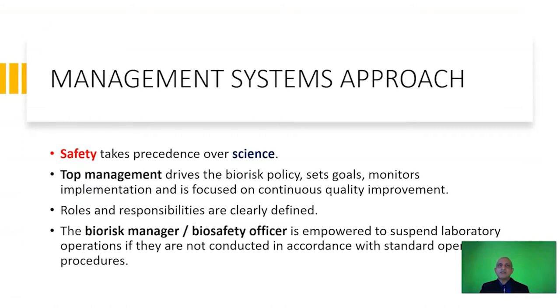What we adopt in biorisk management is what we call a management systems approach. There are some key fundamentals which you should note. The first one is that safety takes precedence over science. In this case, scientists may insist that they want to carry out the work, but it is at the jurisdiction of the top management, as well as the authorization of the biosafety officer, to determine whether this work can be carried out or not.